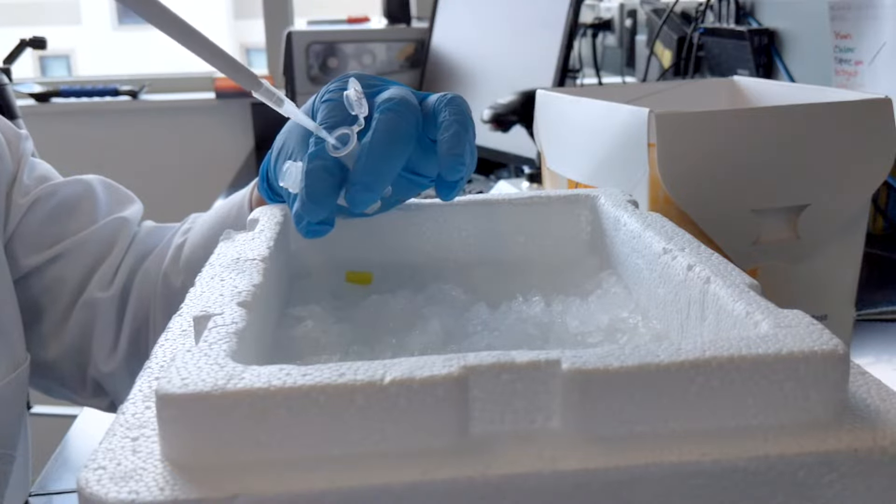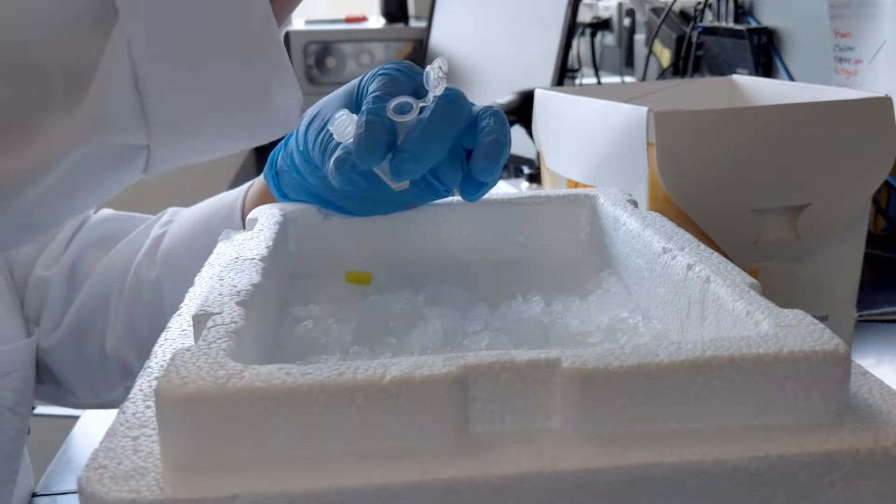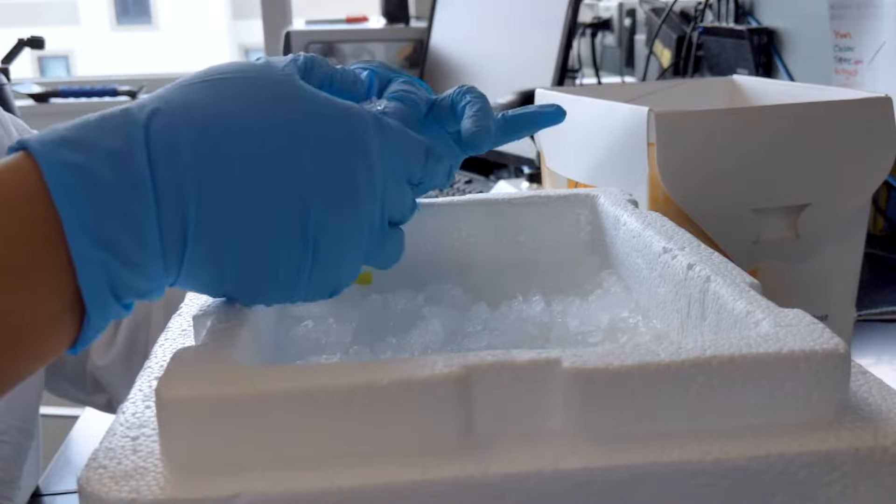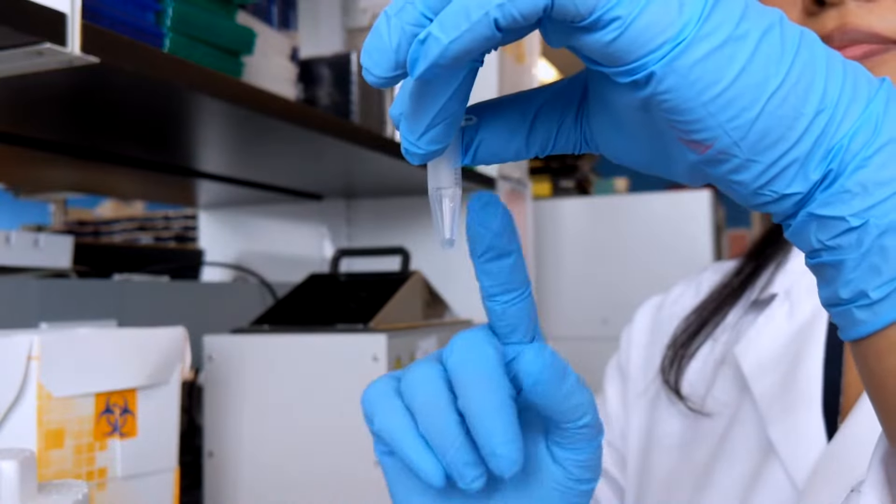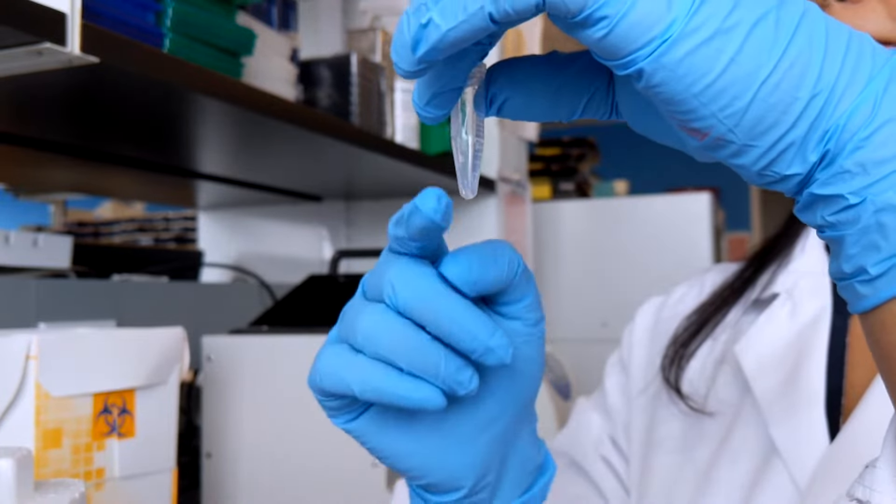Next, add the plasmid DNA to the competent cells. Add between 10 picograms to 100 nanograms of plasmid DNA to your cells. Mix the cells and DNA by gently flicking the tube with your finger.